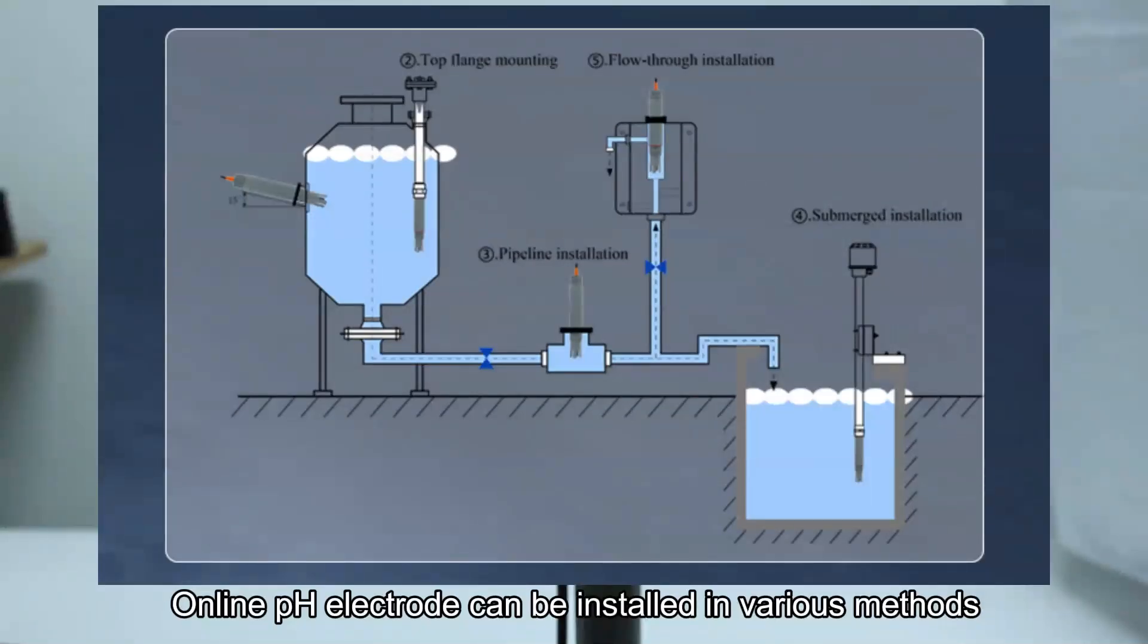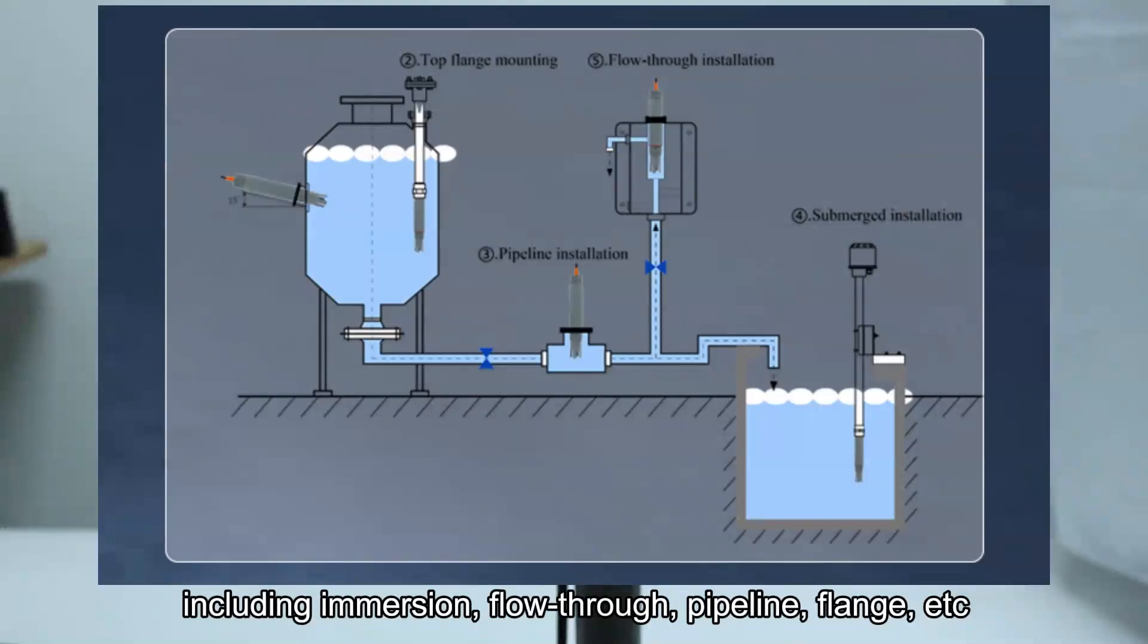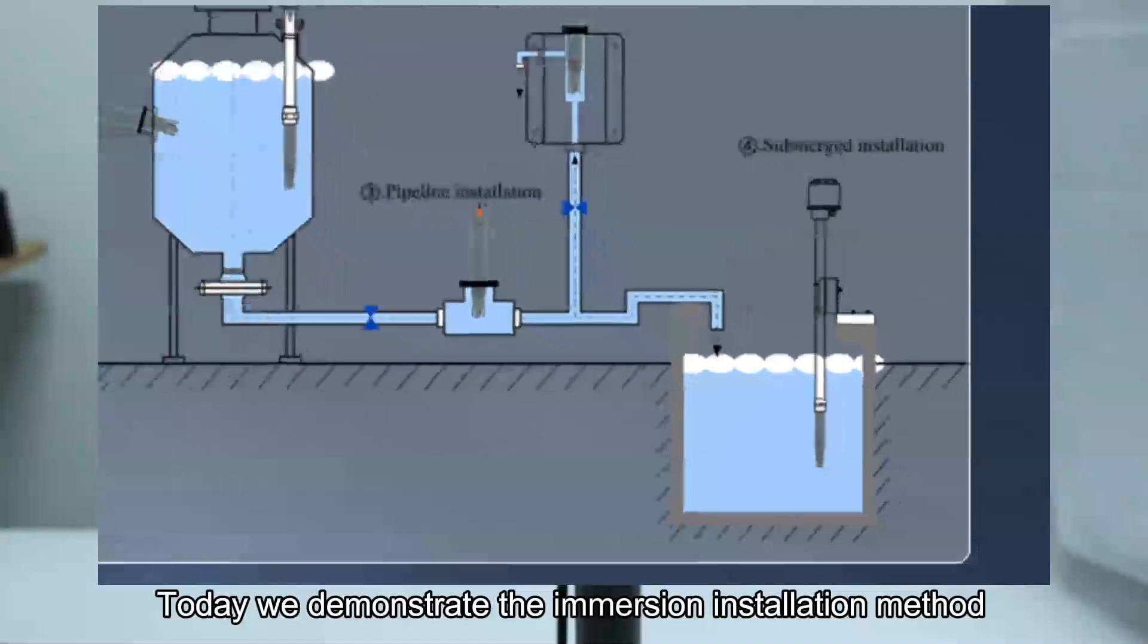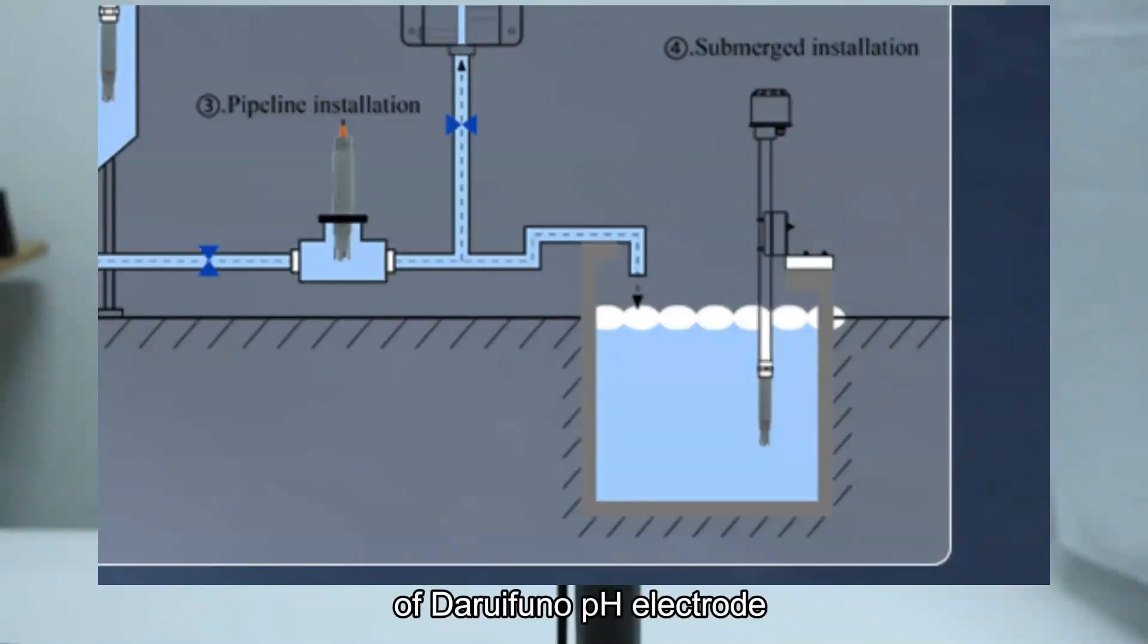Online pH electrode can be installed in various methods, including immersion, flow through, pipeline, flange, etc. Today we demonstrate the immersion installation method of Daruifuno pH electrode.